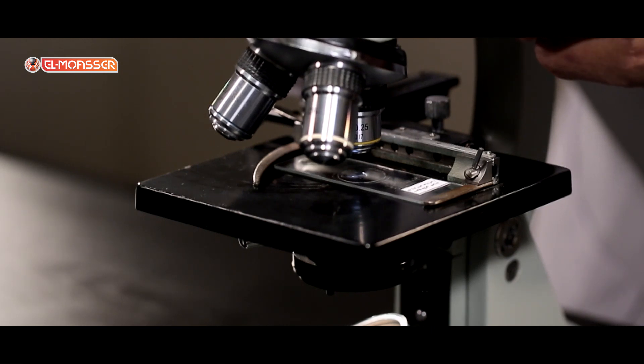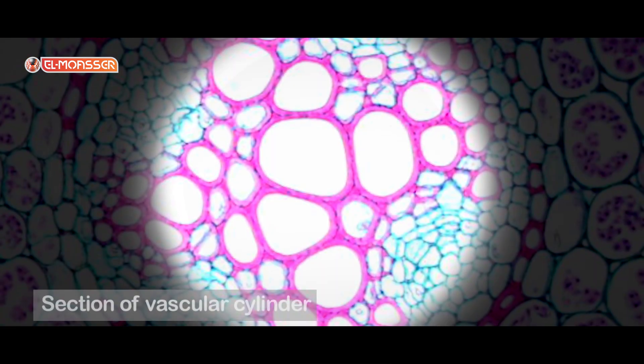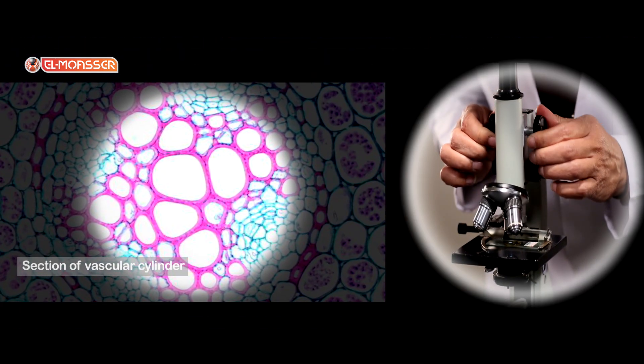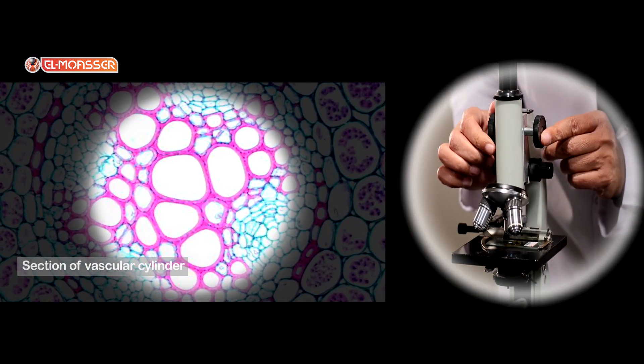Place the second slide on the stage. This is a section of vascular cylinder that contains the phloem tissue and xylem tissue. These are from the types of plant tissues.